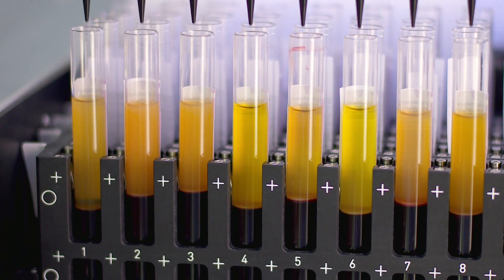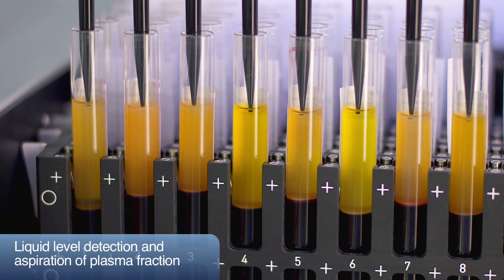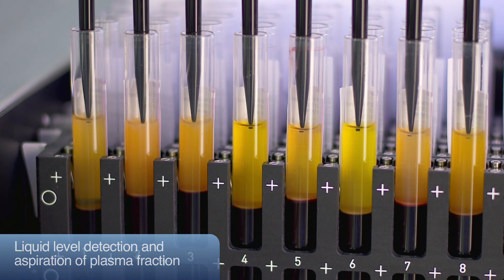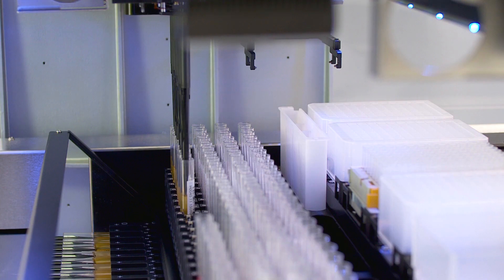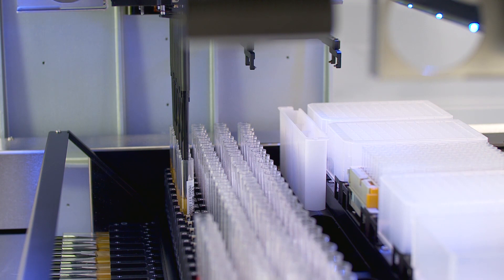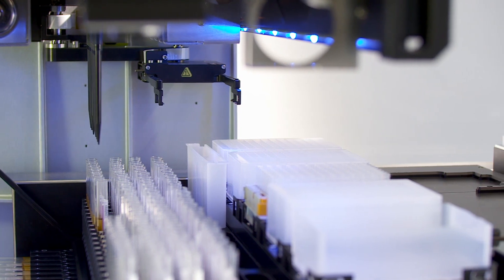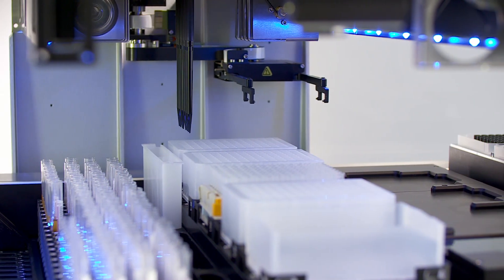In order to reach the undisturbed buffy coat, plasma is pipetted off using a Hamilton CoRe disposable tip. The plasma can be pipetted into one or multiple aliquots depending on the downstream processing or storage requirements. The Venus software performing the pipetting steps offers full flexibility in terms of volumes and number of aliquots.